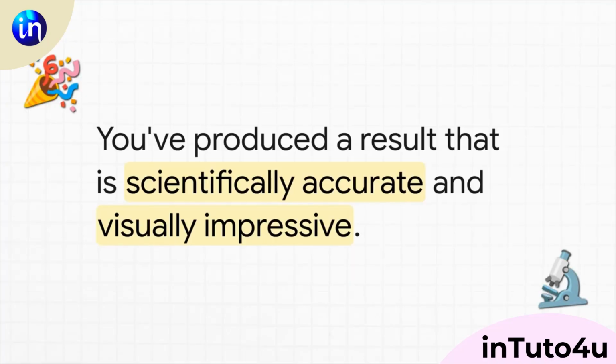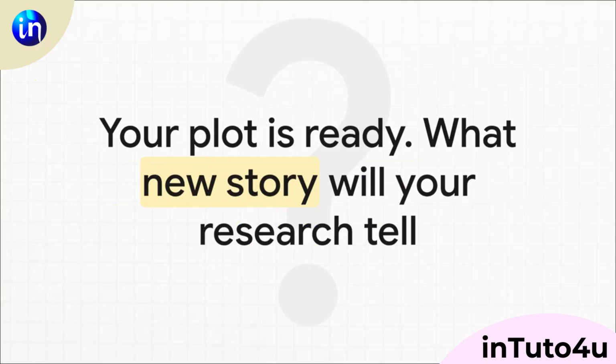And there you have it. That's the whole process. In just a few minutes, you've gone all the way from a raw data file to a polished, publication-ready figure. It's something that is both scientifically spot on and, let's be honest, visually impressive. So your plot is done. It's ready to go. The only question left is the most exciting one of all: now that you have this powerful way to visualize your work, what new story is your research going to tell?